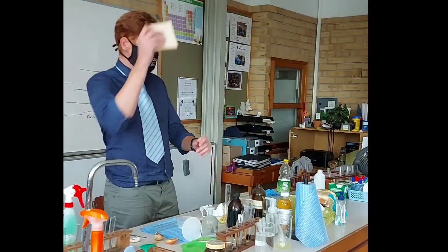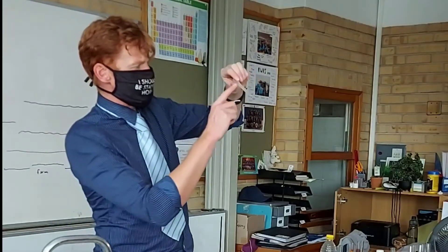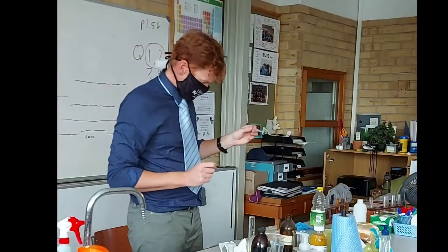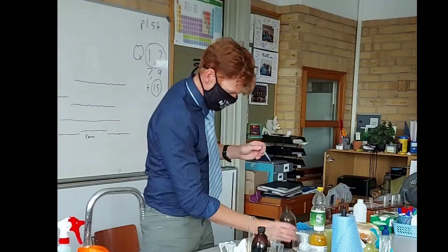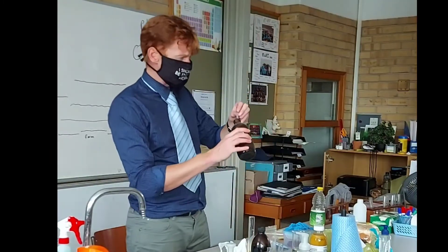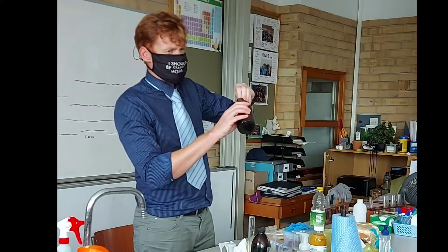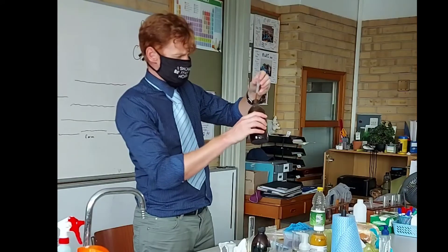And then just the bread. Now these tubes contain three milliliters. We're going to take the iodine solution and put about four or five drops on each specimen.